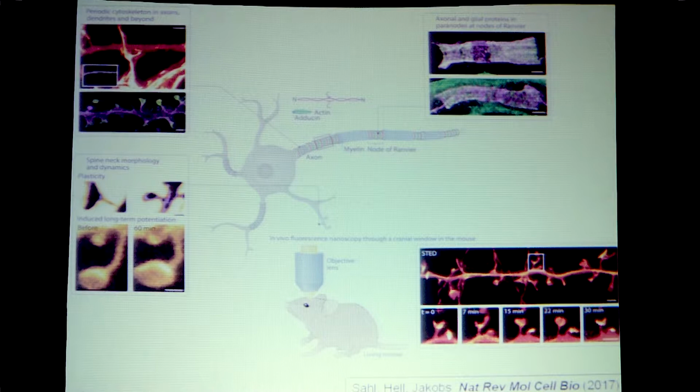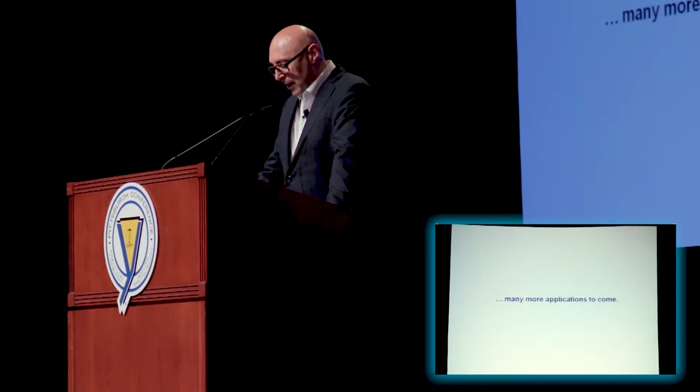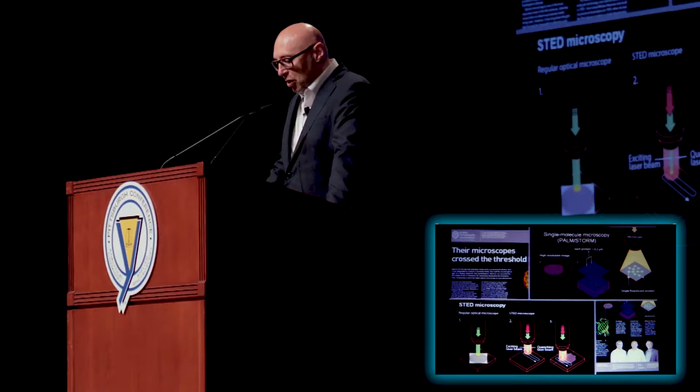And this is shown actually in this nice little panel on the right, on the bottom, showing the dendritic stretch of a dendrite with spines and so on. And in the movie, you can see them even move. Now, I'm not going to talk much about STED microscopy, although that's clearly something that was very close to my heart, and still is very close to my heart for many, many years. I will talk a bit about more recent developments and my motivation for these.